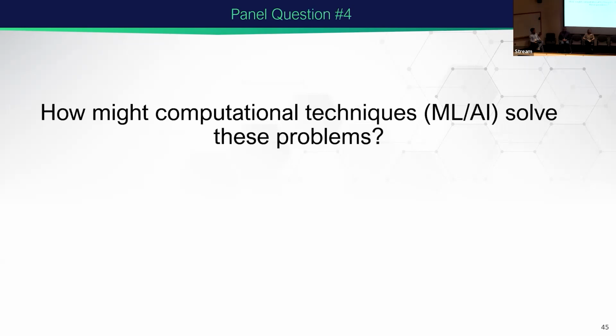But yeah, there's a lot of potential within this. It's something that we're going to have to develop over the next 10 years. It's really one of those big problems that hopefully over the next decade, a lot more data scientists will come into the field and be able to apply a lot of these really nice techniques that have been done in data science, but now to the actual biology. Compressed sensing is also another one. FTMS can be very slow, up to 10 seconds per pixel. So there's also some aspects of trying to see whether we can use ML and AI to reduce the time spent on each of these. So lots of different perspectives and problems, and some of this can be applied directly to it.